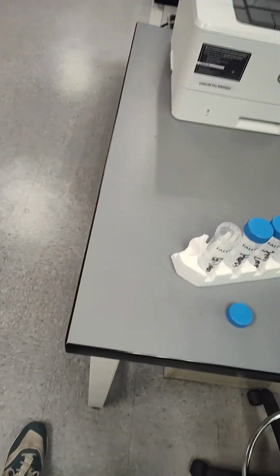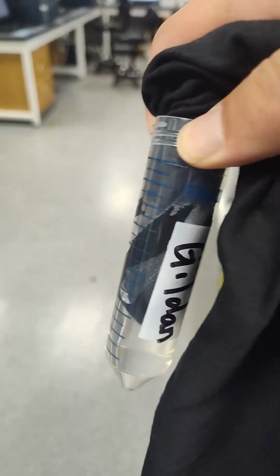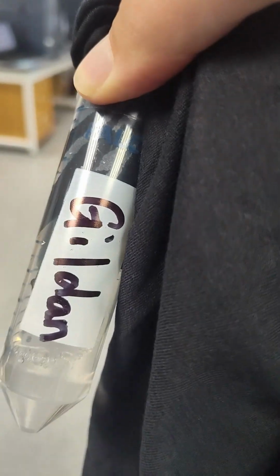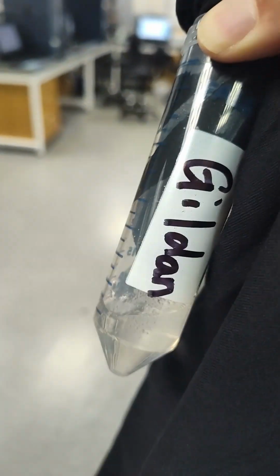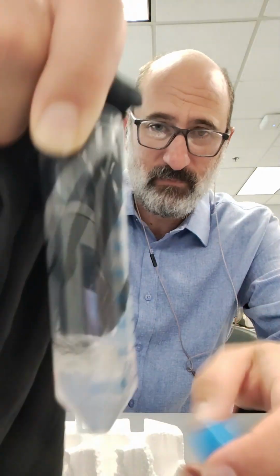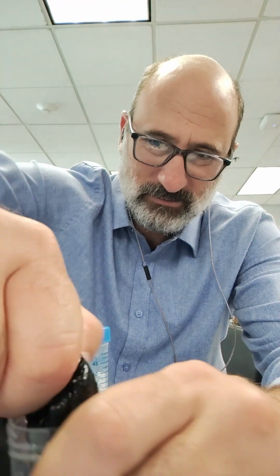Alright, Gildan up first. We're going to just take the shirt, spin it up, and put it into the tube. You can see, shaking it up, it's clearly going to absorb into the material. The next part of the process, after shaking it up for about a minute, is we're going to squeegee it out, squeegeeing the water out.